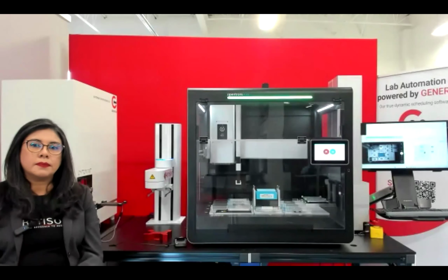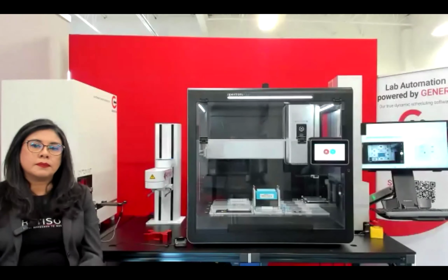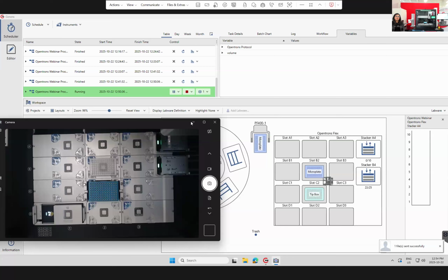Okay. Next question. Looks like this is the last one for now. So if anyone else has other questions, please get them in. Okay, cool. Is it possible to set different variable values for different batch runs? Igor? Ooh, that's a great question. And the answer is yes, you can. That's something I did not show, but I could quickly show.